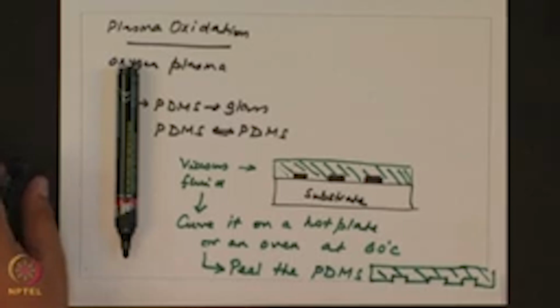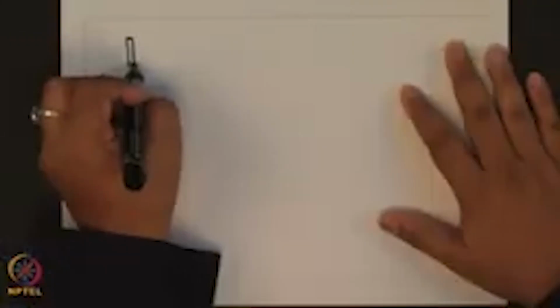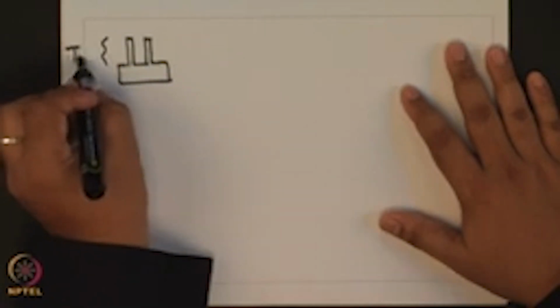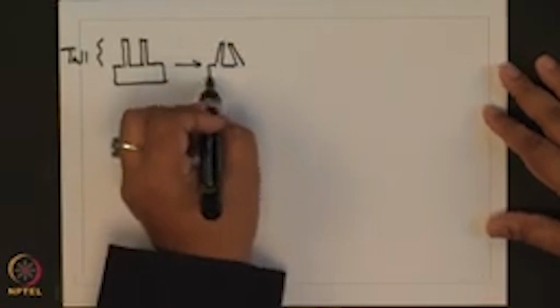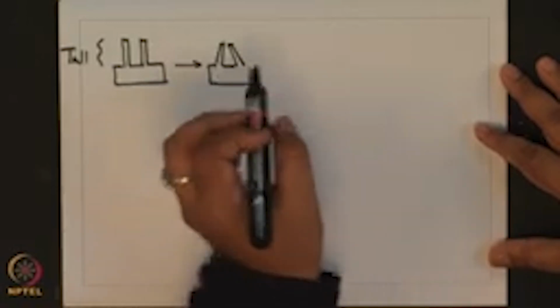Now, of course, what you can tweak is these geometrical features. However, you would intuitively expect, for example, if I am making this kind of a pattern where these features are very tall, you might have defects where these actually collapse onto each other. This is an example of a defect, and this is called pairing.